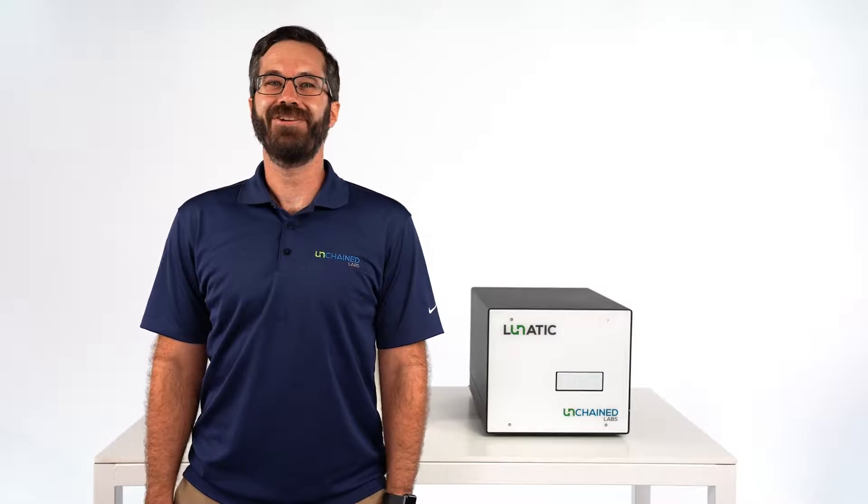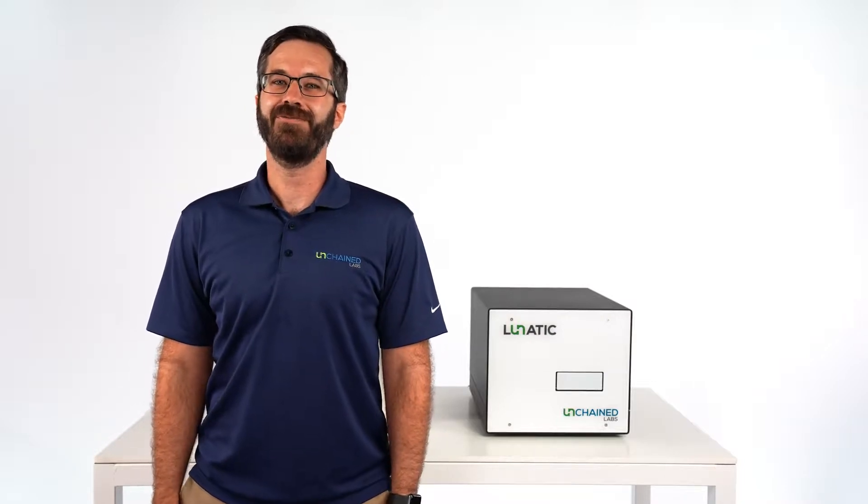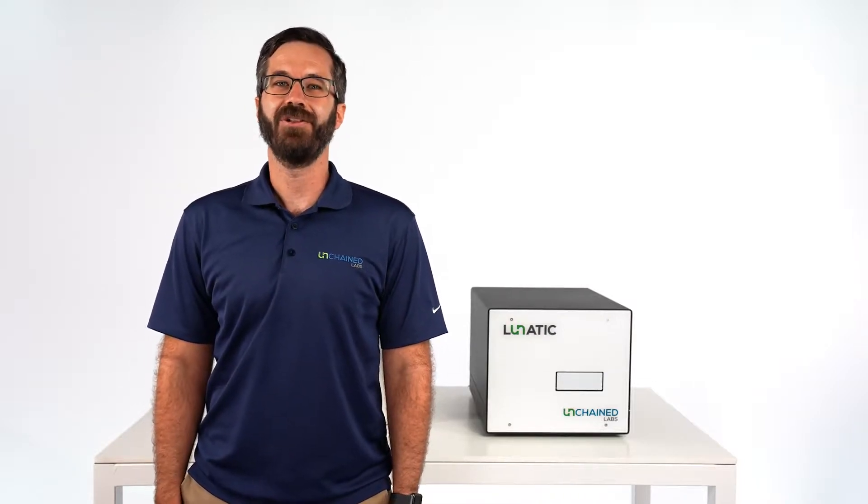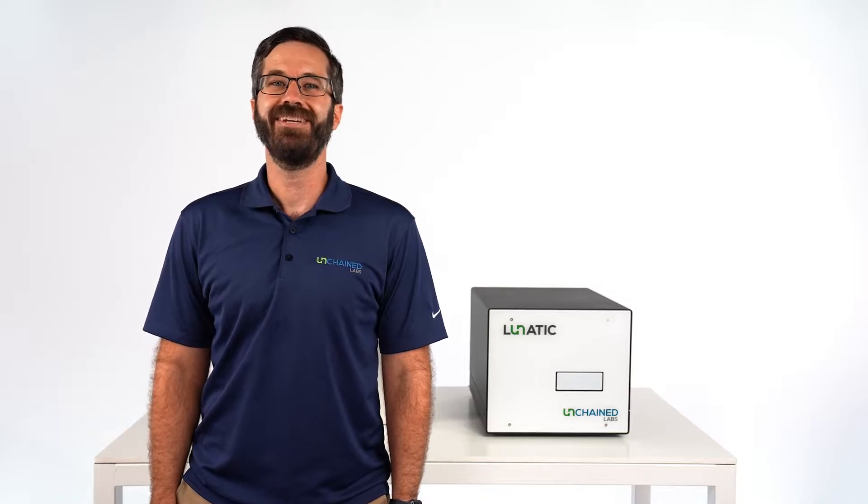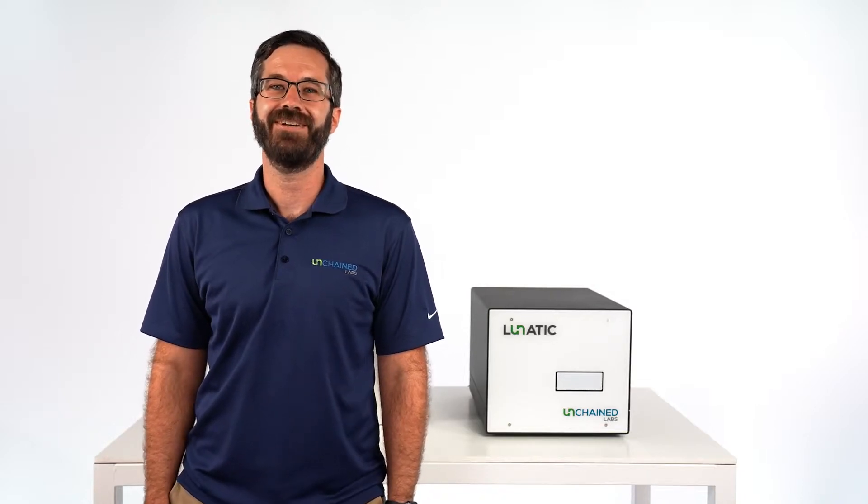With its combination of accuracy, precision, high throughput, and dynamic range all read on a low sample volume, Lunatic truly is the next-gen nucleic acid quantification system.